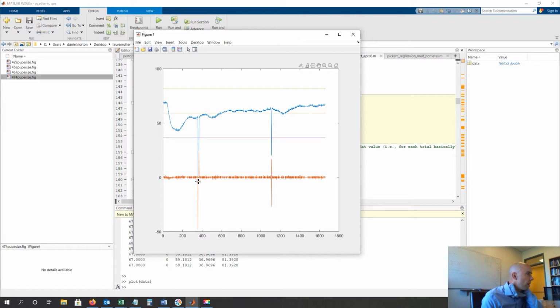And part of that algorithm will be the velocity, or the change. This is the change, how much the pupil size changed compared to last frame. And it's generally 0 or 1 or sometimes 2. And when it really is these artifacts, it jumps to a huge number like -50 or 30 or something like that. So we'll easily be able to toss these frames.